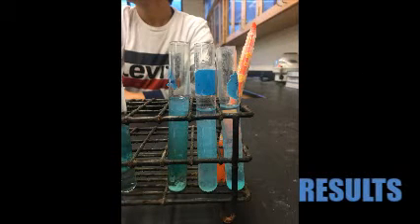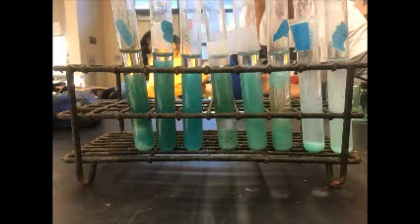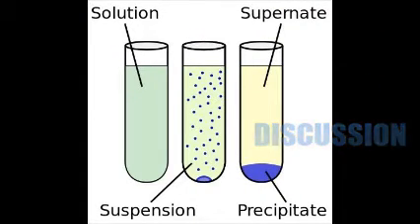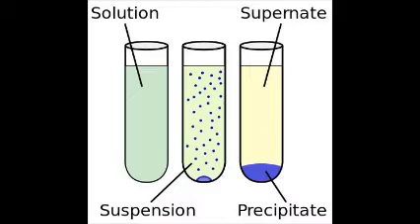We observed the precipitate formed was a crystal-like slushy blue substance. The water was separated at the top of the product. The tubes that had less water added to them were more concentrated, causing the color of the precipitate to be darker. The limiting reactant was found by measuring the precipitate formed by mixing the solutions using different ratios.